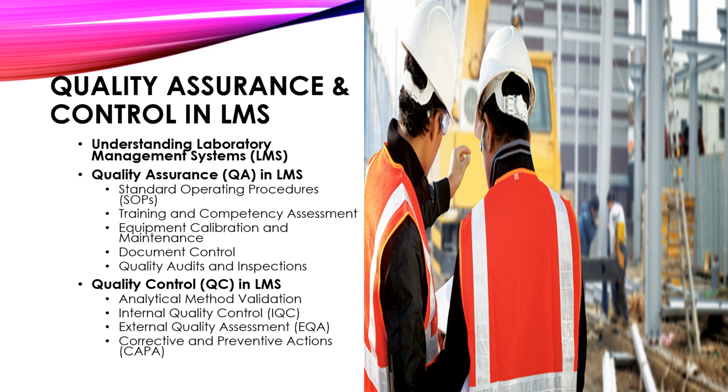Now, quality control in LMS, laboratory management systems. We just discussed quality assurance in laboratory management systems. Now, quality control involves the systematic monitoring and evaluation of analytical processes and test results to detect and correct errors or deviations. Unlike quality assurance, which focuses on preventive measures, quality control is primarily concerned with detecting issues that may compromise the accuracy or reliability of laboratory data.